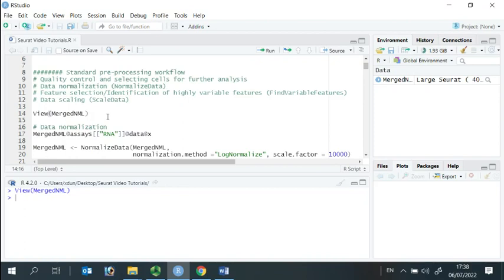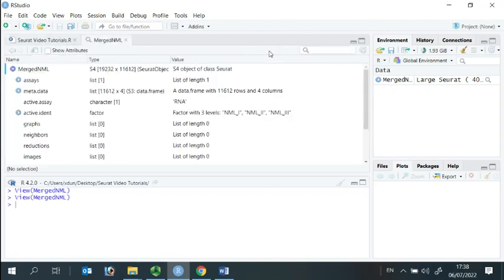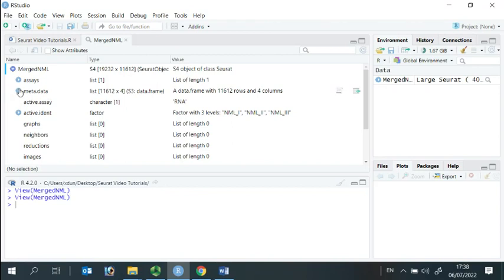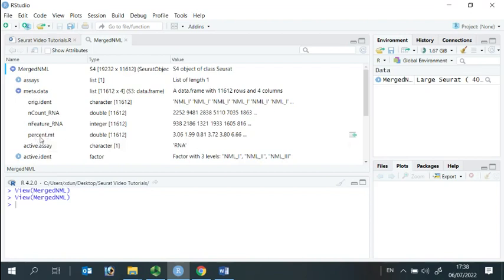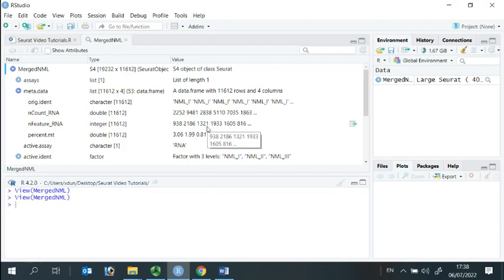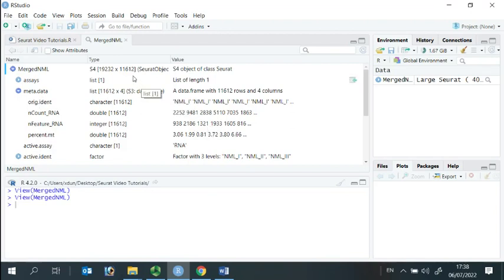Let's have a look at our Seurat object to see where we store our data. We store the quality control metrics in metadata. In previous analysis, we stored the percentage of mitochondria gene in the metadata. Following cell selection, we kept 11,612 cells for further analysis.